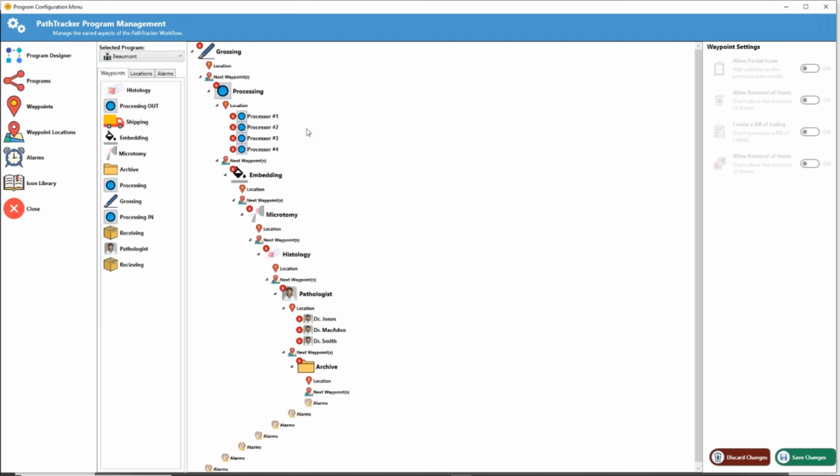The other thing we do is we have two different ways of looking for individual missing cassettes. Let's say you receive a basket that had 150 cassettes at the previous scan, and now it's only got 149. We will then flag that cassette as missing, and there will also be an alarm sent for that.